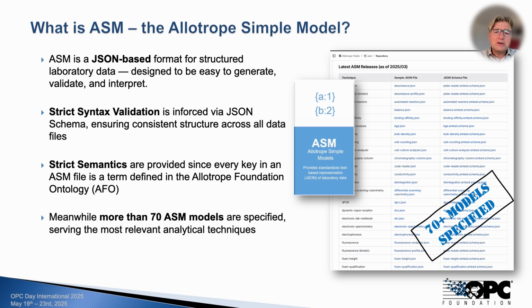Today, there are already more than 70 ASM models available, covering many of the most common analytical techniques in laboratory environments, from simple techniques like weighing or viscometry, all the way to complex analytical techniques such as HPLC measurements. ASM delivers FAIR data by design: structured, meaningful, and ready for integration, right from the moment it's created.